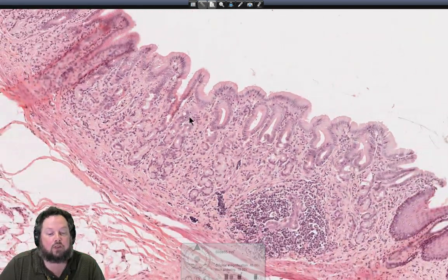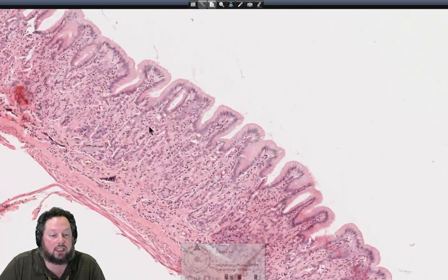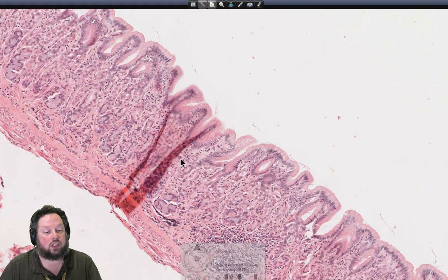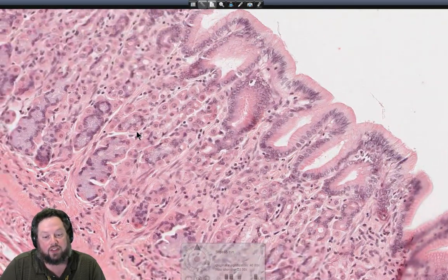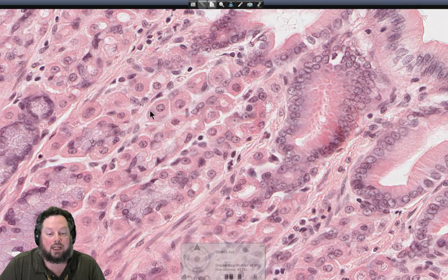The second region of the stomach, which we can actually see if we move along a little bit further, is known as the body, or the fundus, or body and fundus, histologically identical together. And this is what it looks like here. It's characterized by having these different cell types within the glands. The top of the cells predominantly have these very acidophilic cells that have these lovely round nuclei, often described as having sort of a fried egg type of appearance. So this would be the egg white, and the egg yolk is the round nucleus in the center here.